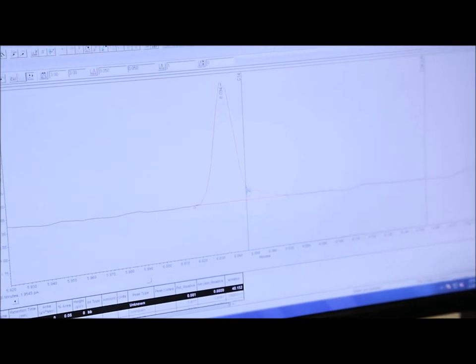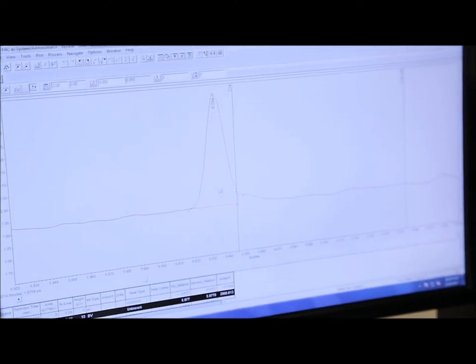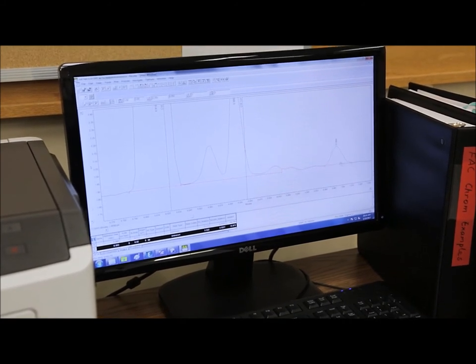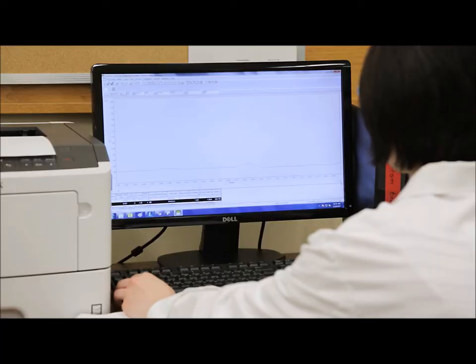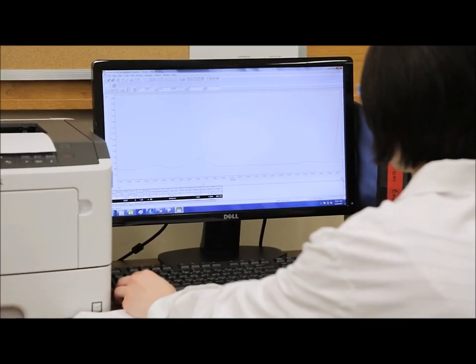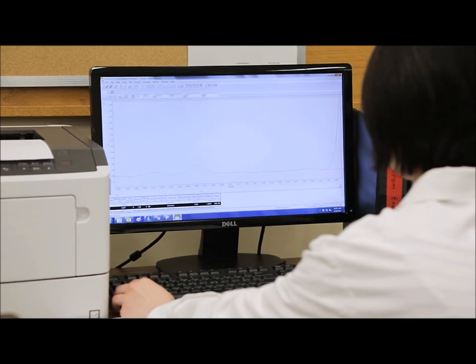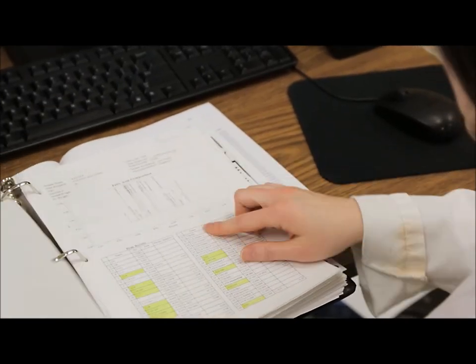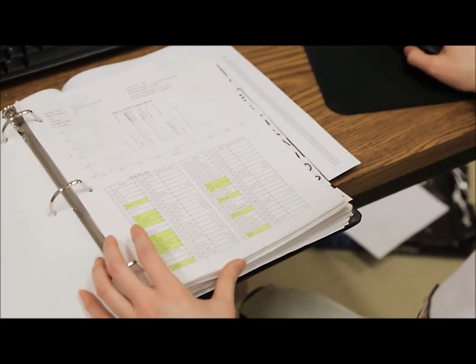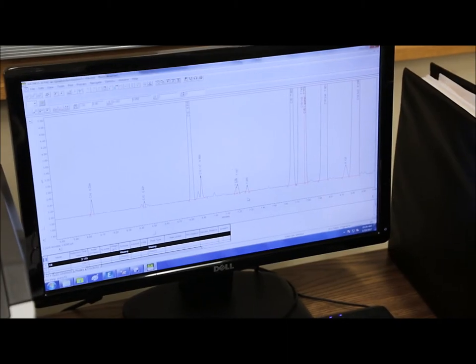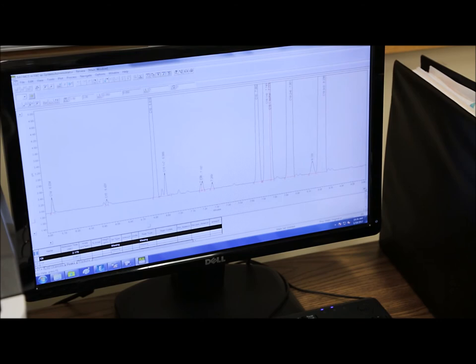Once the samples have been run, we can now integrate them using the Empower software. This is the most important part of running the samples is the integration. You can use reference material, mixed or individual standards, or other identical sample types to ensure that your sample is being properly and accurately integrated.